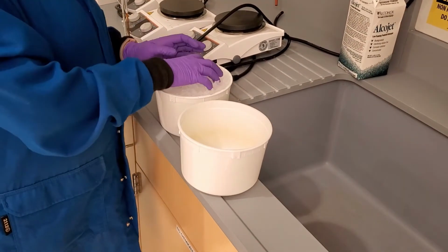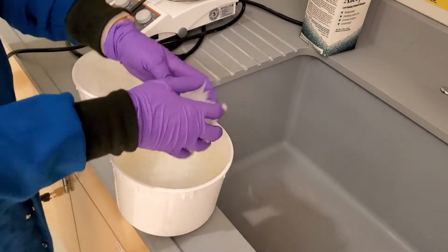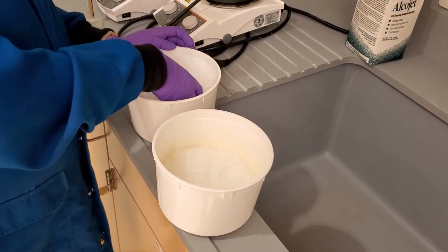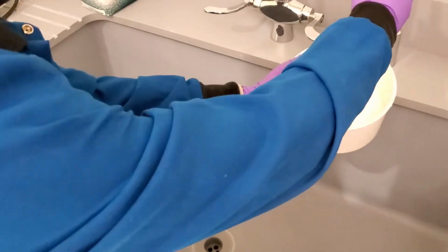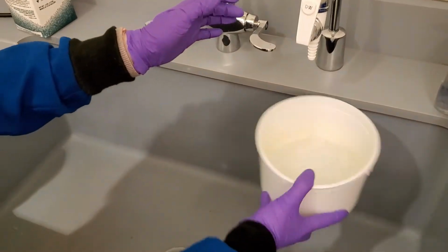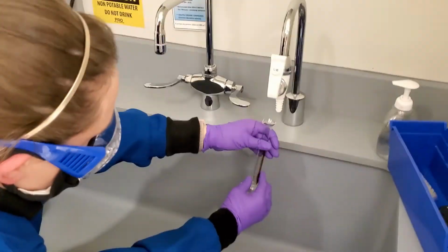First, we will start by preparing our ice bath. This way, our water can cool while we prepare the other reagents and start our reaction. Ice was obtained from the stockroom. Add ice to the container and add water. Adding water will ensure that the entire surface area of anything we place in the ice bath will be cooled.